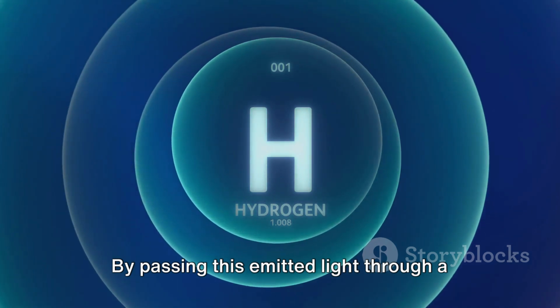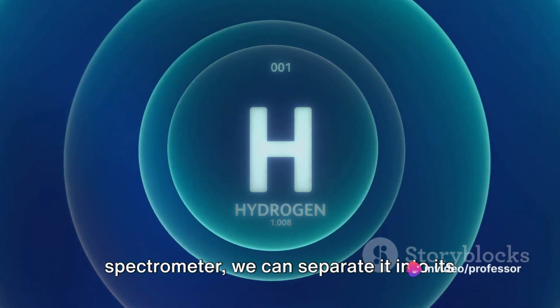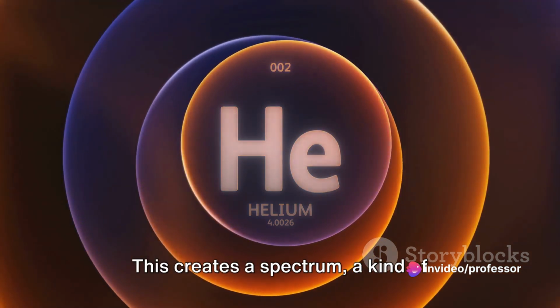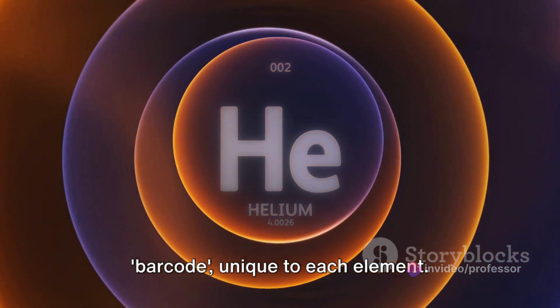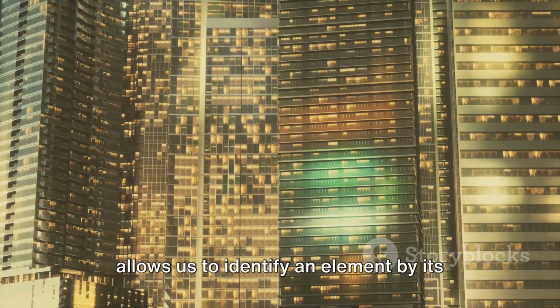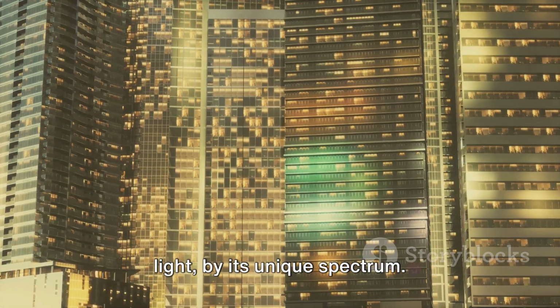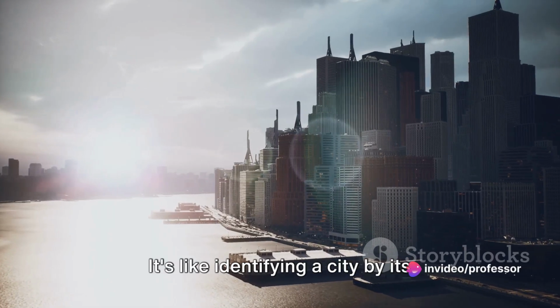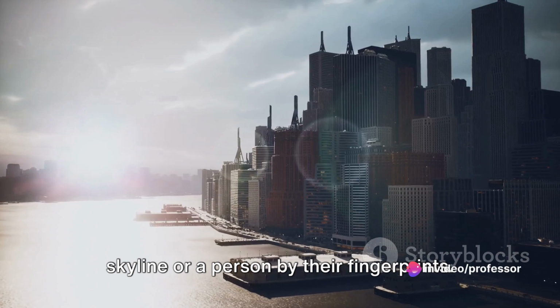By passing this emitted light through a spectrometer, we can separate it into its individual wavelengths. This creates a spectrum, a kind of barcode, unique to each element. In essence, atomic emission spectroscopy allows us to identify an element by its light, by its unique spectrum. It's like identifying a city by its skyline or a person by their fingerprints.